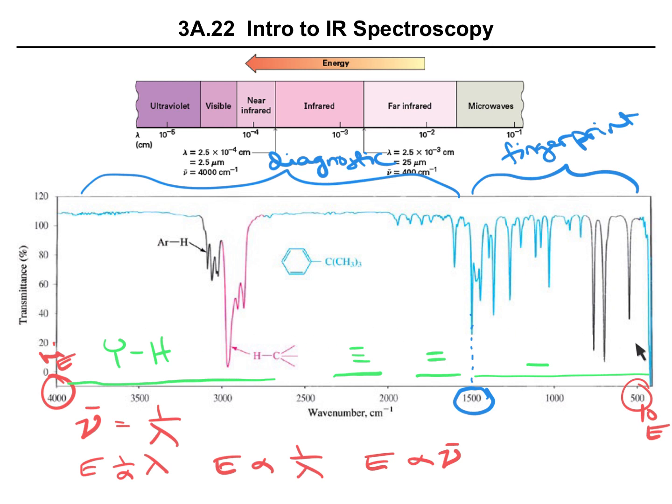As we're looking at an IR spectrum, so far we've been talking about seeing peaks at particular wave numbers corresponding to the energy that matches the bond vibration. But we're also going to look at differences in the strength of the signal. So these signals are kind of short, they don't dip down very far. This one is long, it dips down much further.